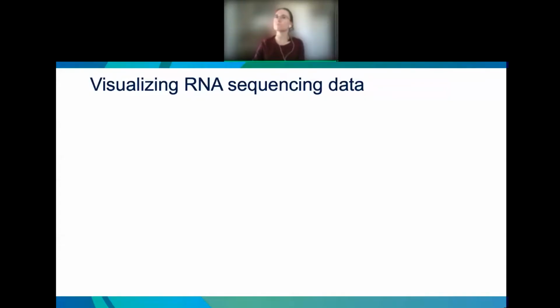So I'm going to go over visualizing RNA sequencing data. I'm going to go over the different types of visualizations and the statistics behind them that we're going to use. And then, if we have enough time, we'll come back to the notebook and actually make these visualizations. So please shout out or put something in the chat if you have any questions.